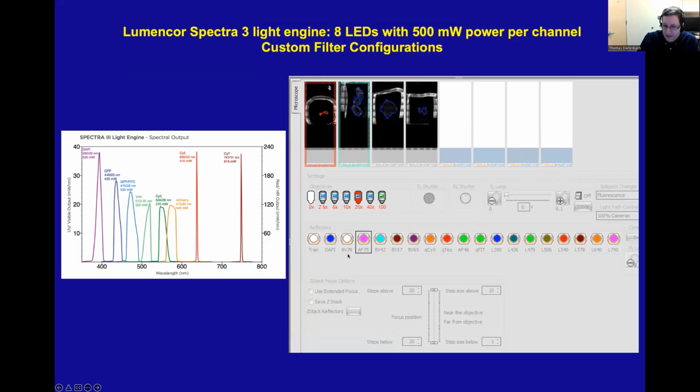And then we have now, on most microscopes, if you were to see the control interface, you'd only see 4 filter sets, right? DAPI, FITC, rhodamine, and Cy5. Of course, this system is rather unique, I think, in the world because we have our old setup and then we have a slightly newer, the multispectral setup.